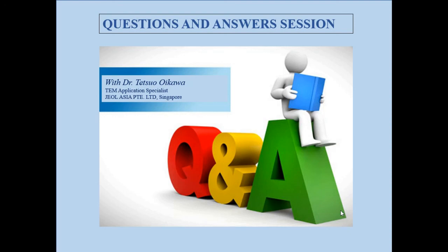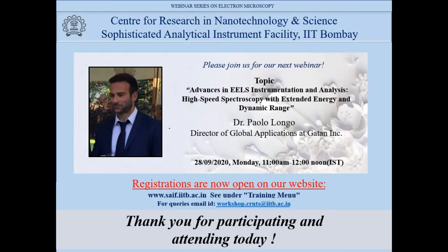Mainly in this work, I recommend electron diffraction, not the electron image, because the electron image includes aberration, as mentioned before, lens aberration, and also background intensity. But electron diffraction does not suffer from aberration, so electron diffraction gives much more precise diffraction intensity from the specimen.